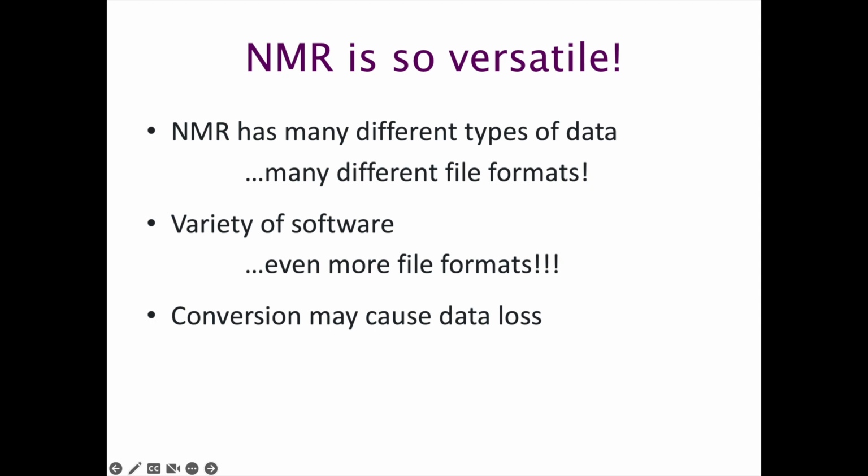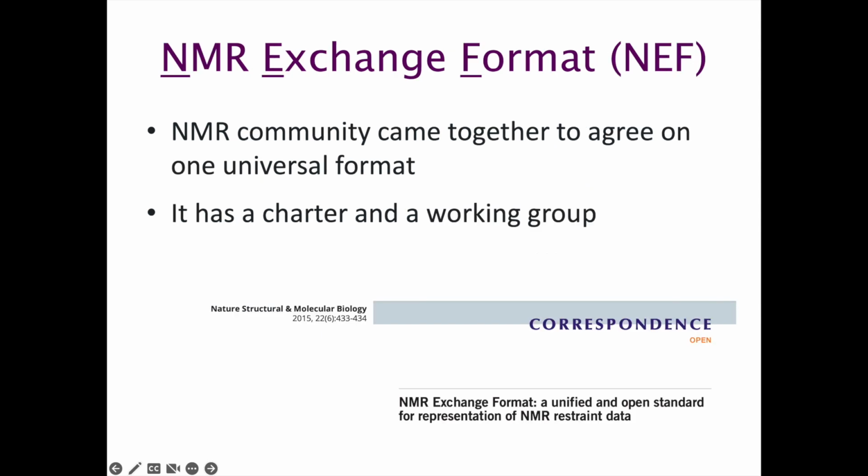So a number of years ago, the NMR community came together to agree on a new universal format. There is a charter to this, the NMR exchange format, or NEF for short, and there is also a working group. And if you want to know a bit more about the background, have a look at this paper from 2015.